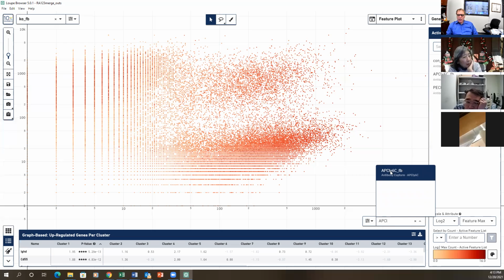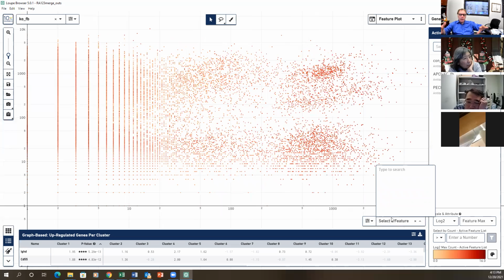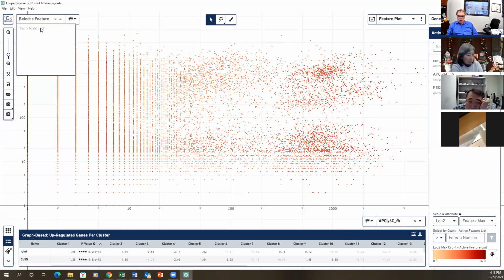One thing I was thinking, can I just say something? In flow cytometry, you get a positive and a negative, and you can see separate populations. That's what it looks like in the FACS plot. You see some double positive, and then you see this one. There's some background, there's always some background. But you can tell the difference.